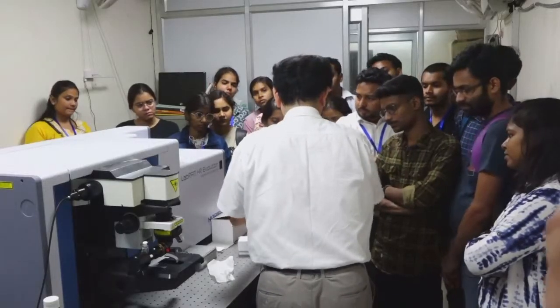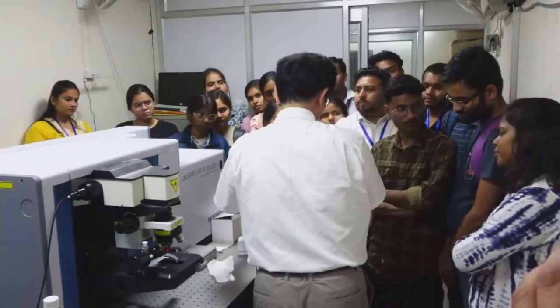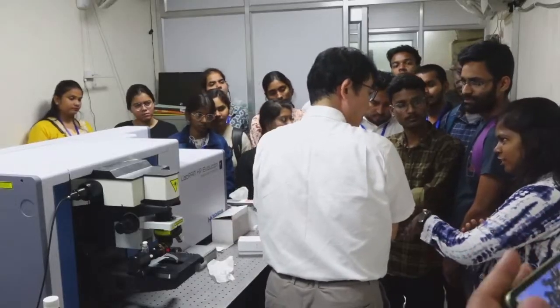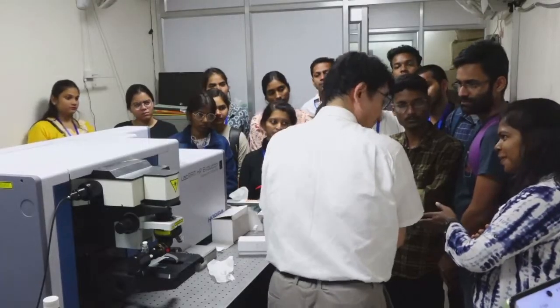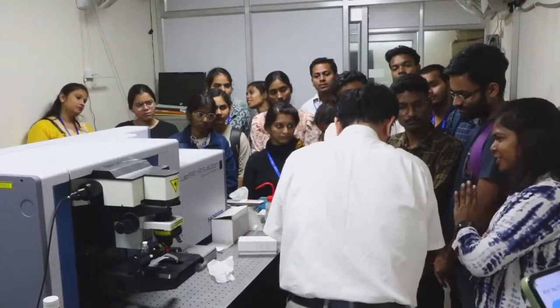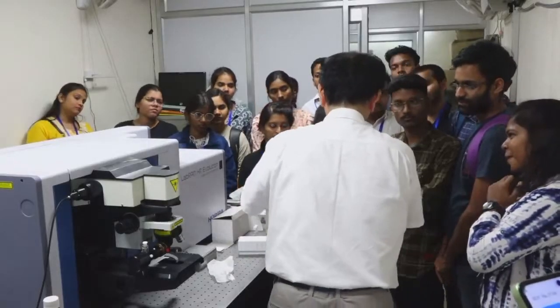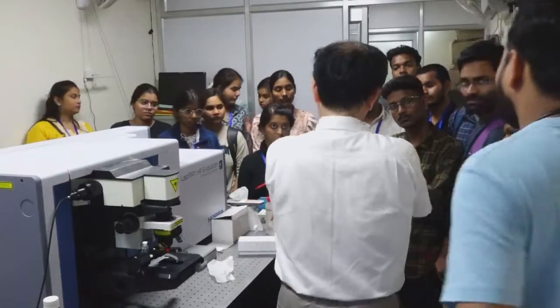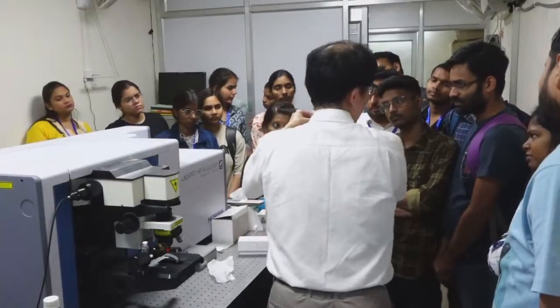So it's the same, this direction, this direction. Some amount of light must be lost in other directions. The scattering light in other directions, except 90 degrees, is getting lost now. Right? That will decrease the intensity of the Raman signal. What is the difference in the intensity of the Raman signal between the two configurations? In principle, it's the same as far as the numerical aperture is the same.